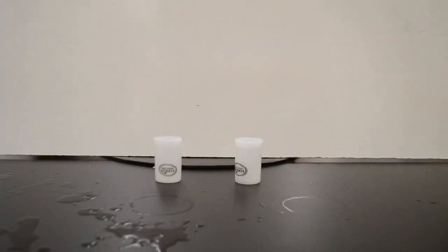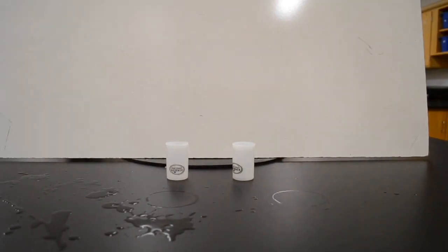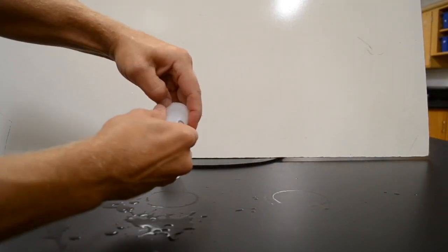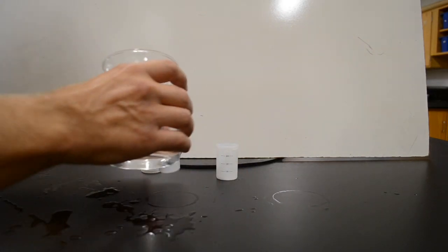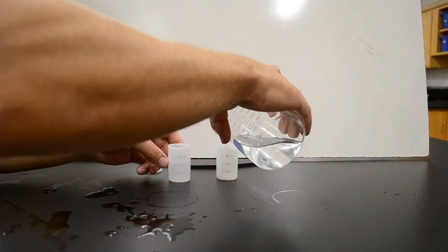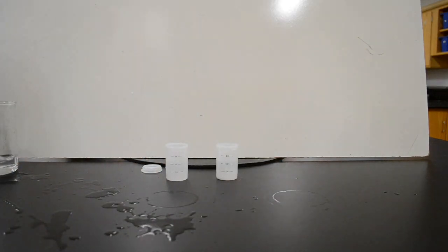Okay, for experiment number 2, I have 2 little canisters here. Now I'm going to start by filling these canisters, which are the same type. I'm going to fill them both so they're about halfway filled with water. I'm going to fill them both the same canister.